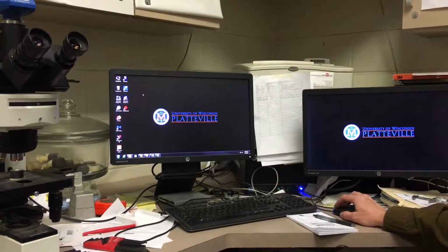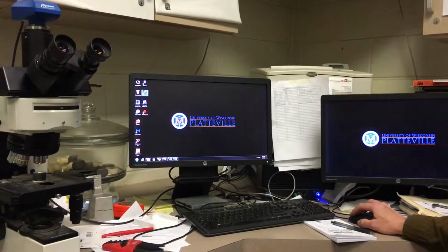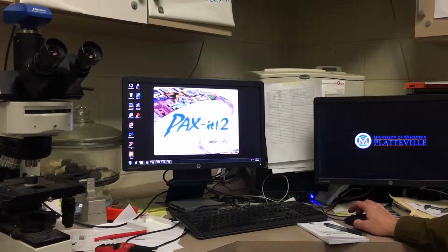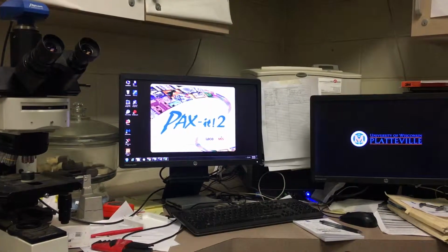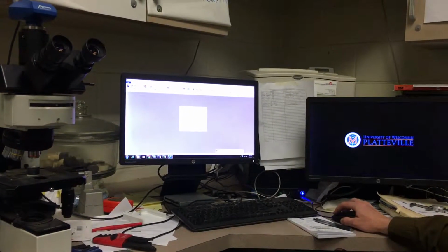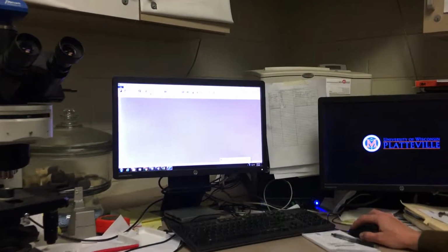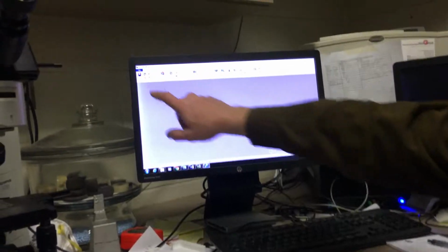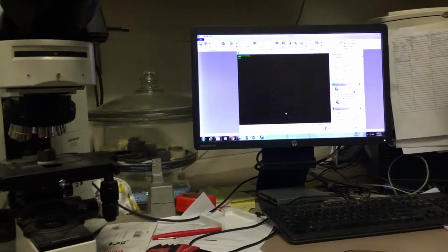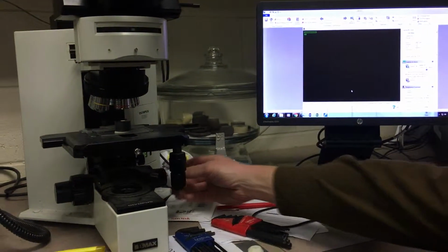Okay, so in order to open up Paxit, just double click on this. This might be a little bit of review, but make sure that when it comes up, you click on PaxCam right there. So the PaxCam gives you the camera there. Okay, and again, you have it somewhat focused here already.